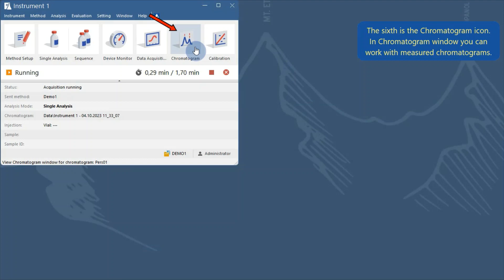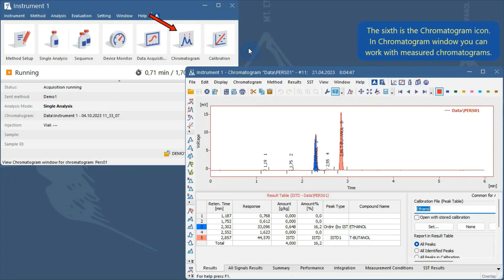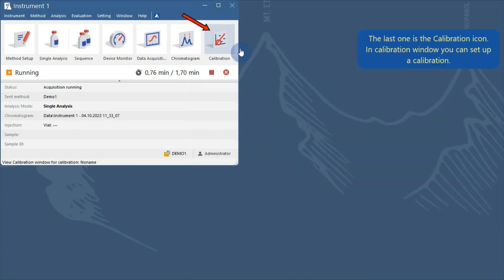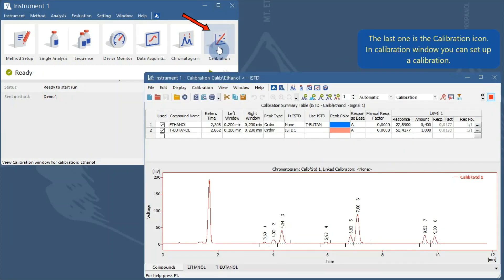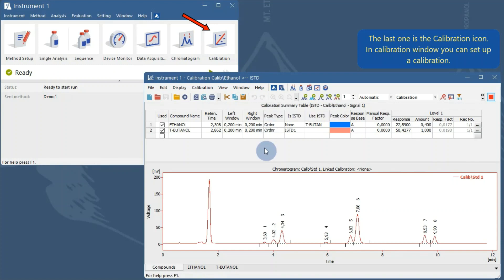The sixth is the chromatogram icon. In the chromatogram window you can work with measured chromatograms. The last one is the calibration icon, where in the calibration window you can set up a calibration.